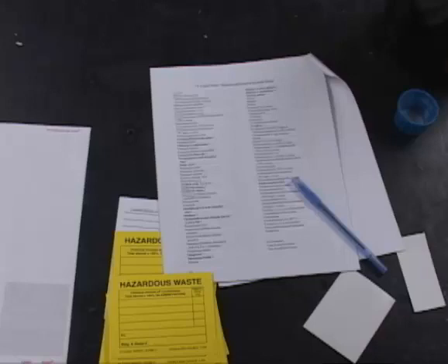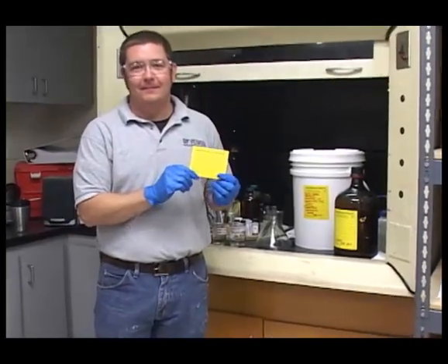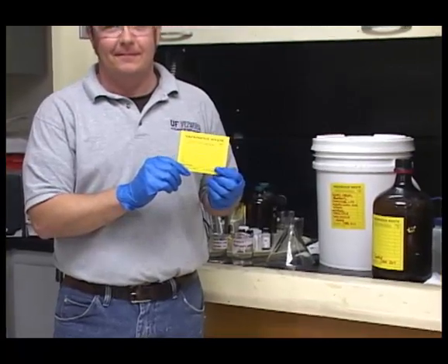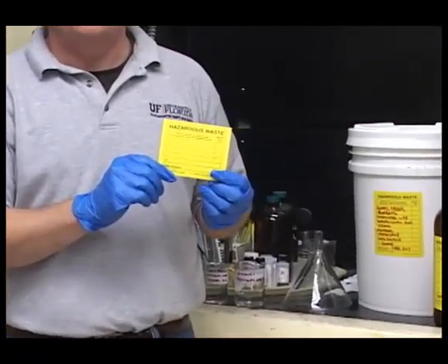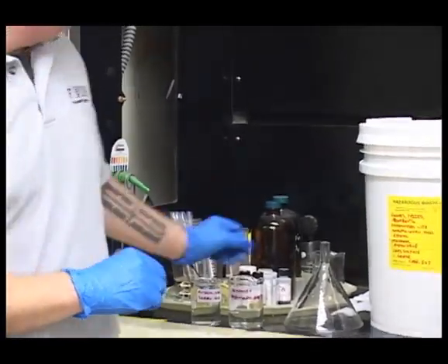Hazardous waste labels are probably the simplest piece of paperwork that a lab worker will complete the entire time they are employed at the University of Florida. Unfortunately, this item is also the one that we notice the most frequent problems with when we are out on campus collecting hazardous waste.